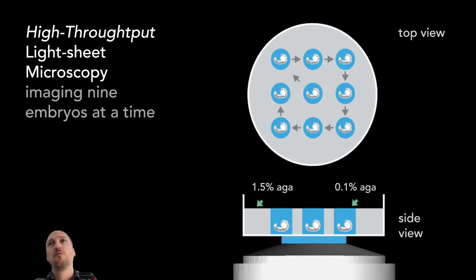And this is much easier than any other kind of multi-embryo mounting schemes that would involve perhaps tubes and such. And more importantly, it's closer to what biologists have been used to doing for the past 100 years or so. Relying on gravity, relying on horizontal surfaces. This is really, we believe, going to make it easier for biologists to adopt this technology going forward.